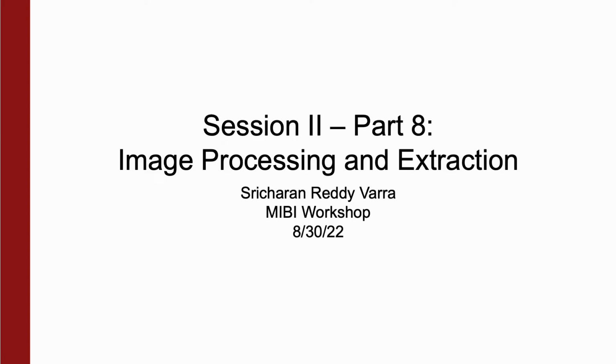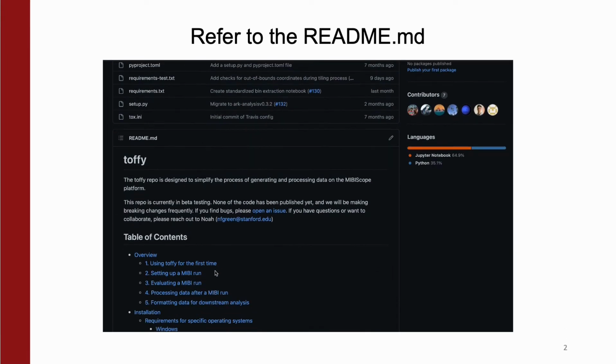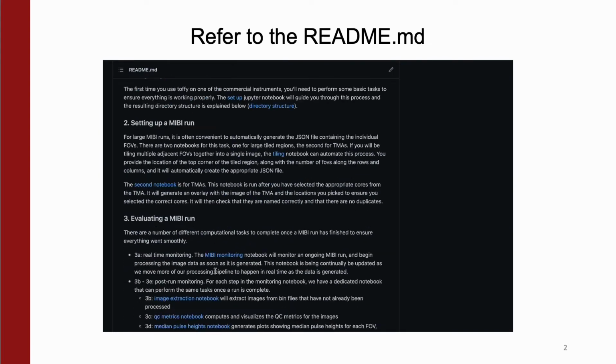Hello, my name is Shri, and this presentation will cover image processing and extraction done manually using the notebooks in Toffy. If you have any questions or would just like to go over more detailed information, I highly suggest you refer to the README.